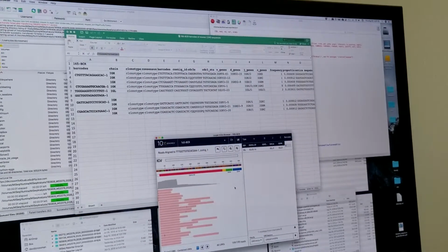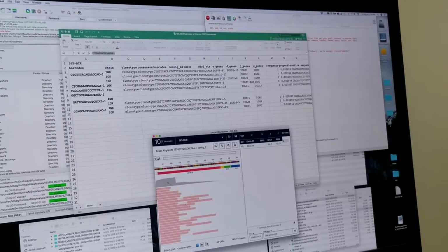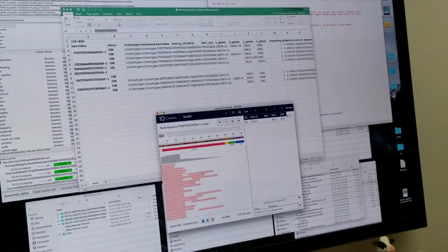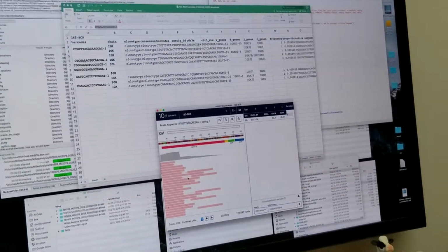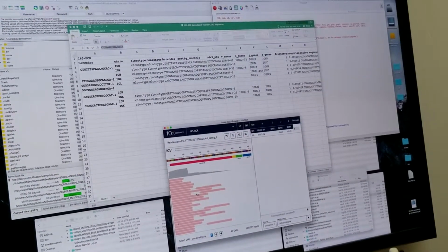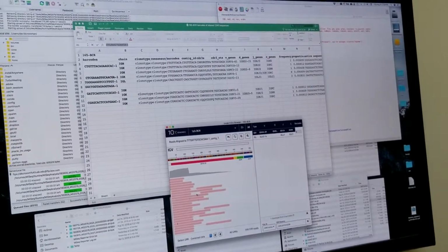Now, is that like 100? I can't read the scale. 50, 100? Is the length of the red one sort of the common length? Yeah, that should be 150 bases at a time. That's all we sequenced: 150 bases in the forward read and 150 in the reverse. Those are the FASTQ files you got. They're 150 bases in length. Can you do it longer?